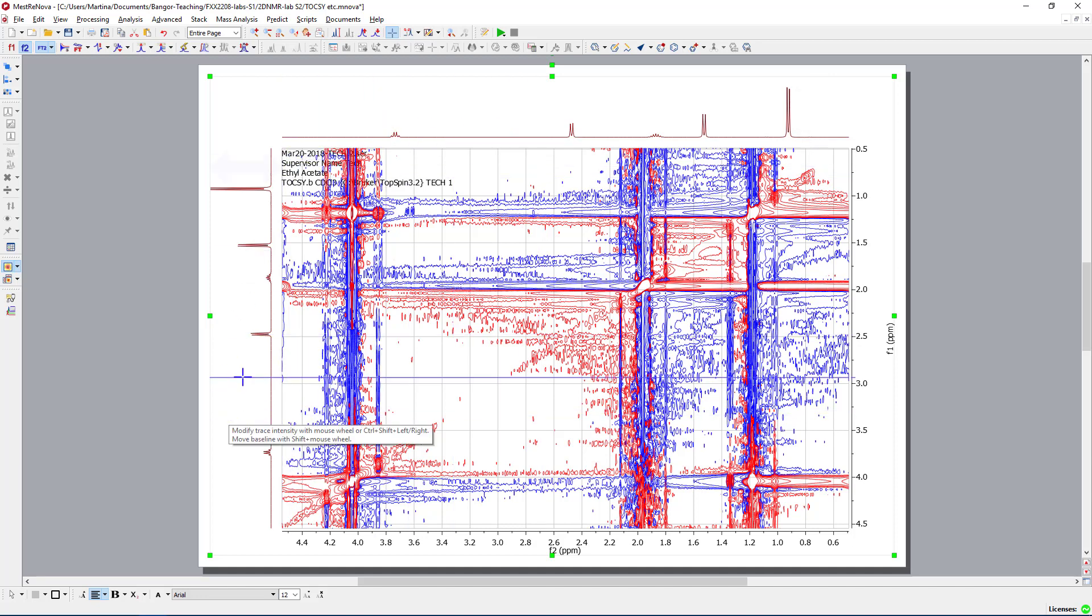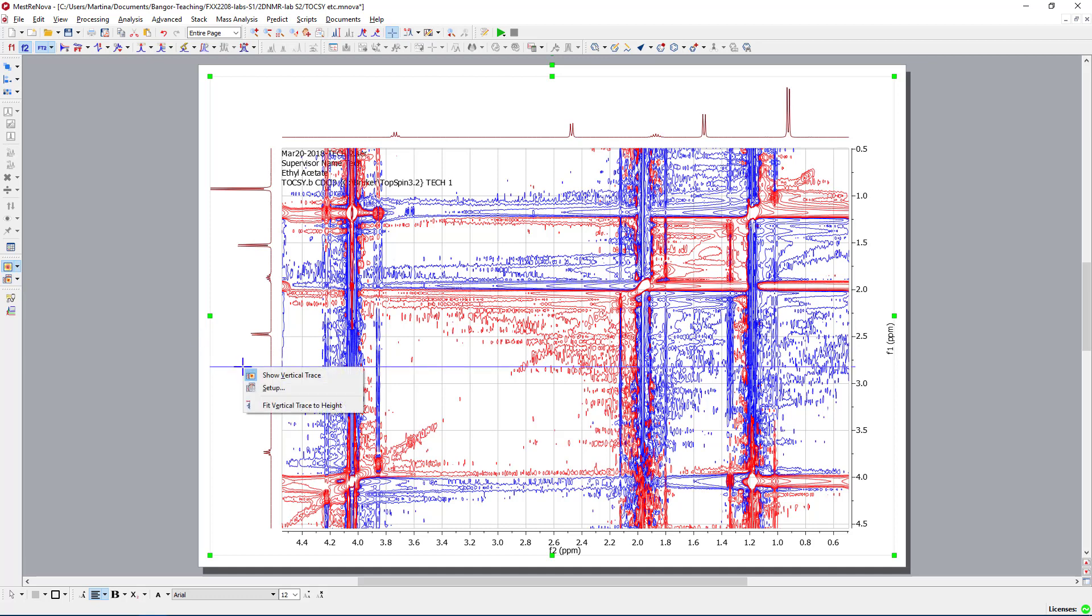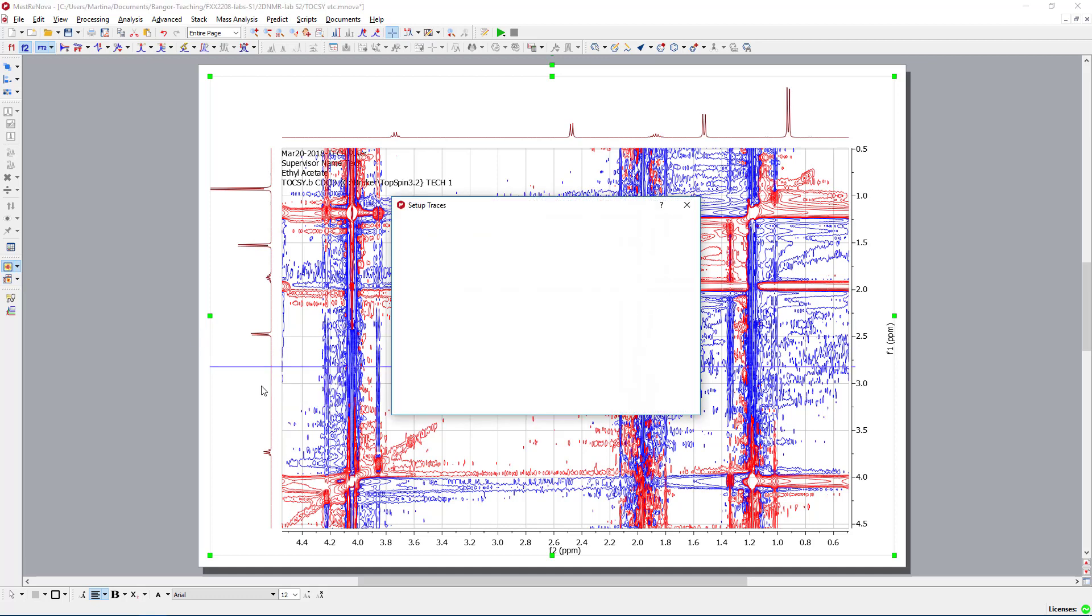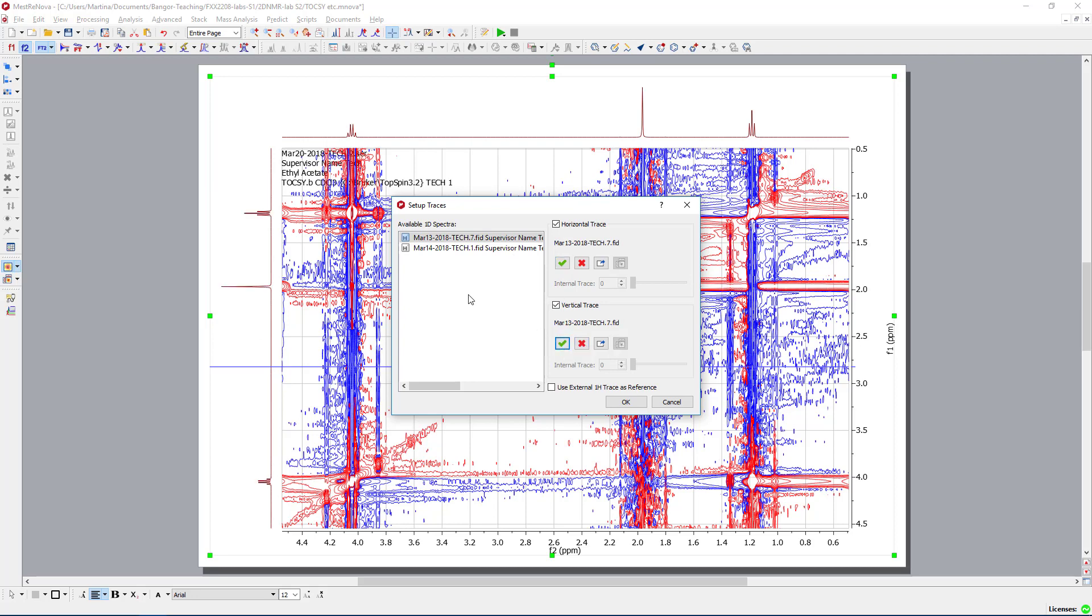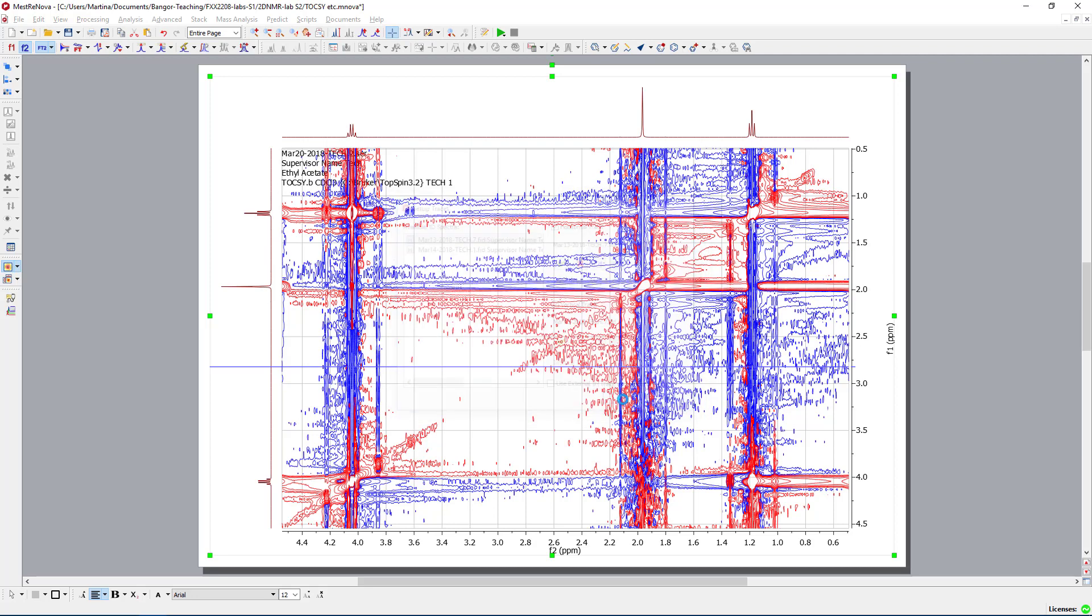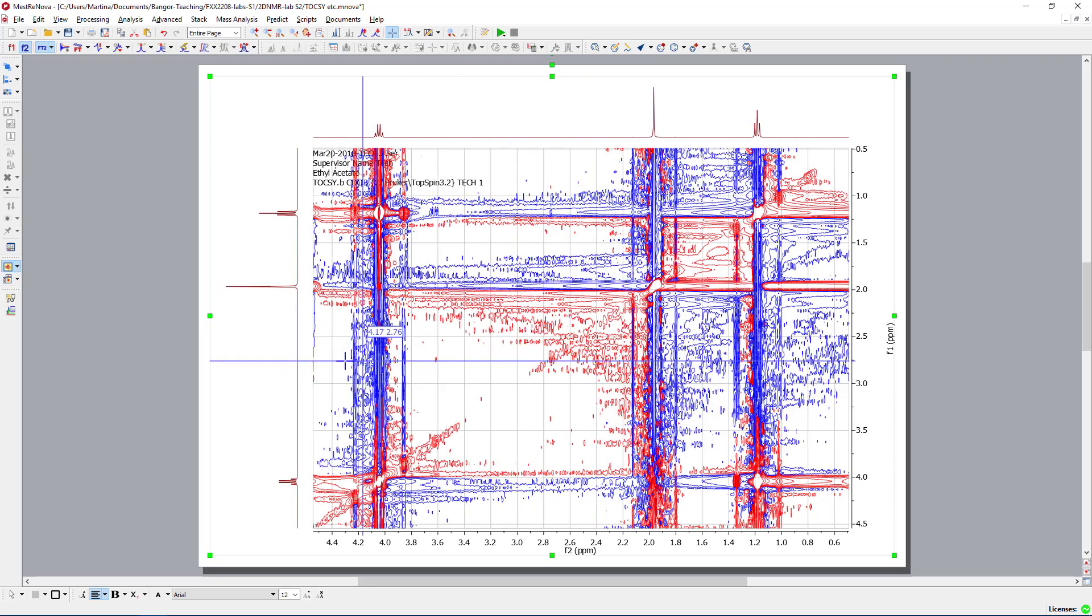The system wasn't able to connect the correct traces. So I go into the setup, and just check what has happened here. In this case, we need to find the correct spectrum, which has been run on the 13th, because I know this is the ethyl acetate, the other one was the ibuprofen.